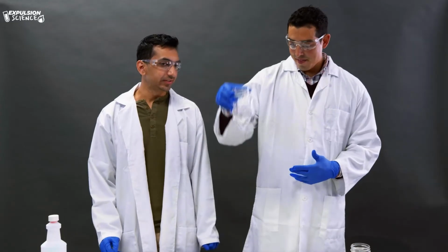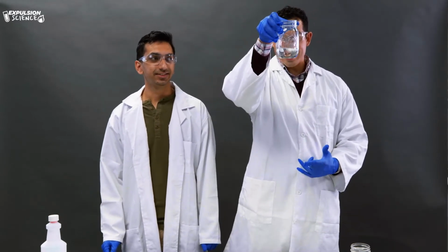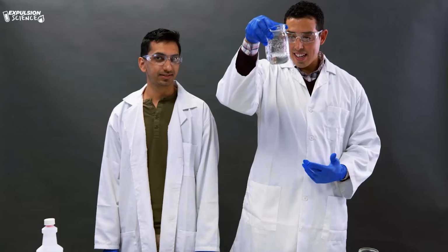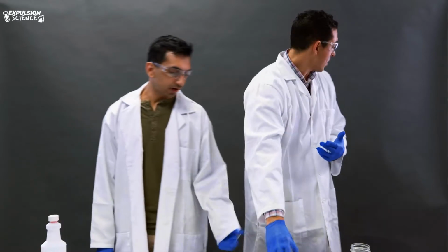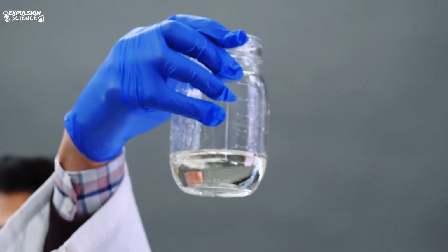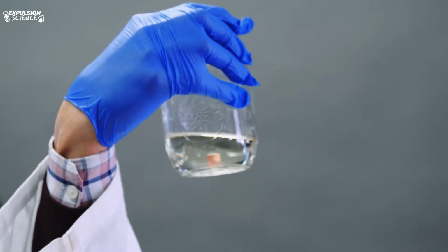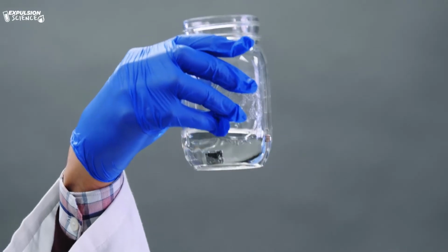How did our zinc do? Well, it's definitely reacting a little bit. I do think the zinc is attaching itself to the chlorine atoms and creating zinc chloride, and in that process, releasing a little bit of hydrogen gas. And how is our copper doing? Not a lot. It's mainly just hanging out. It seems like copper is that much of an inert metal. And then our carbon? It's reacting a little bit, probably really, really slowly.